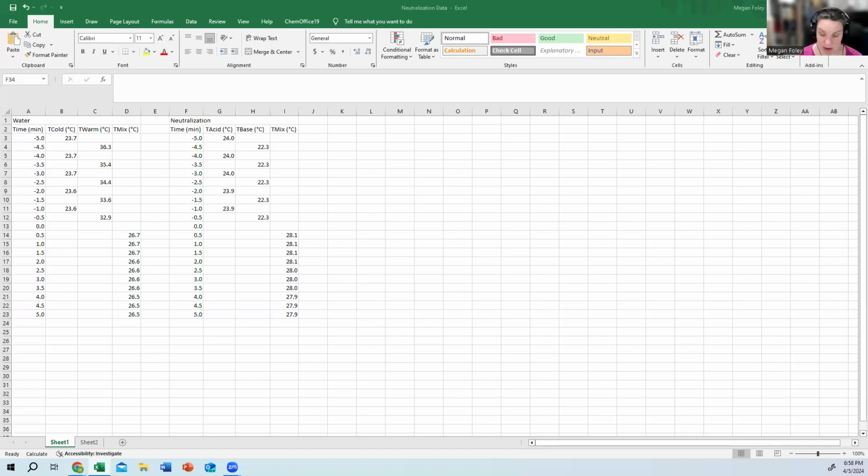Hello, everyone. In today's video, we're going to be going over how to do the neutralization lab. So right here, you can see that I have Excel and I've put all the data points for one of the water trials and one of the neutralization trials. You'll see my times go from -5 minutes to 5 minutes.